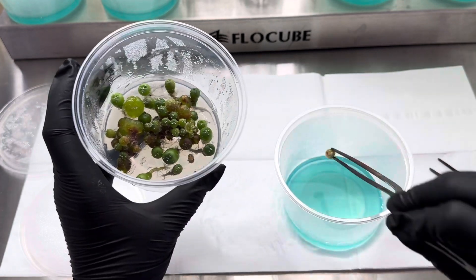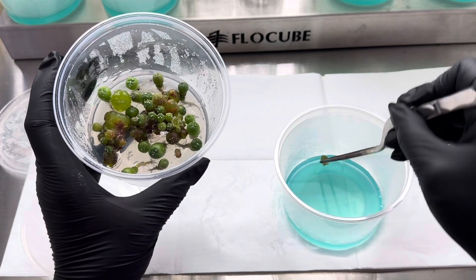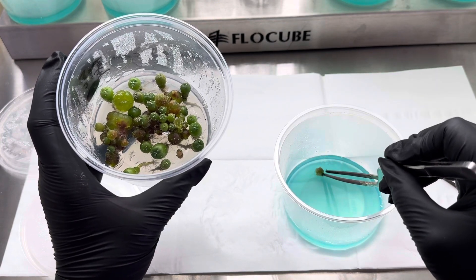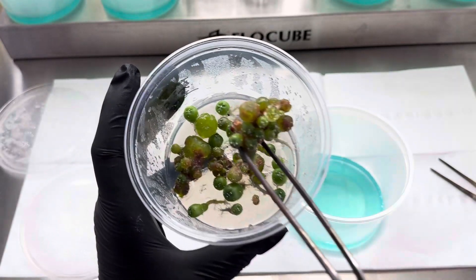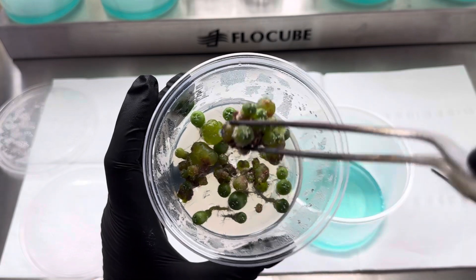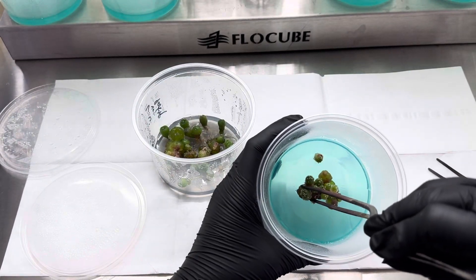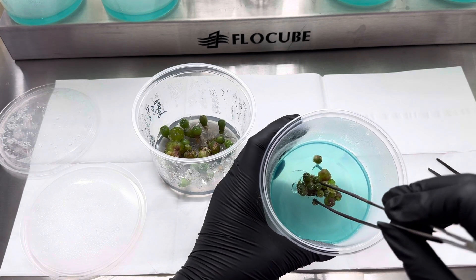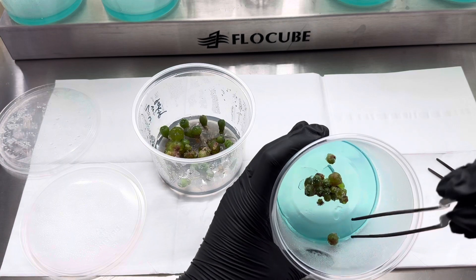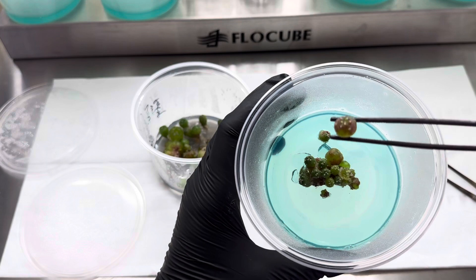The heads just fall right off - always great, perfect. You can see that cluster; I'm actually going to go ahead and place her right into the gel. Potential variegation.